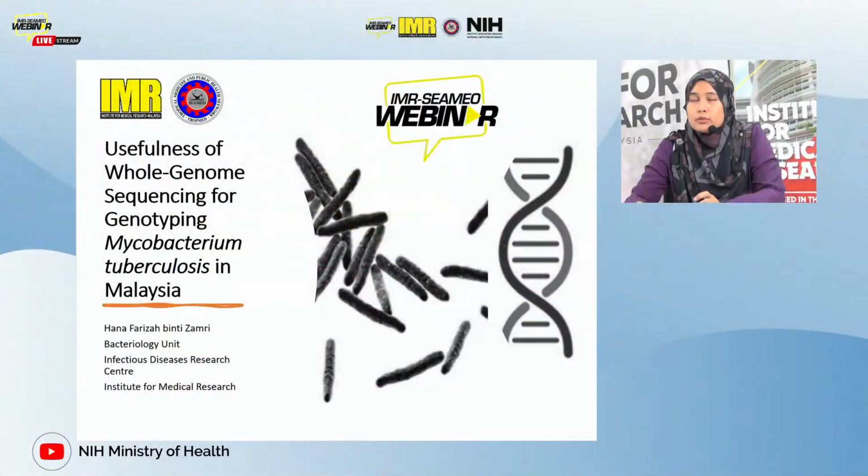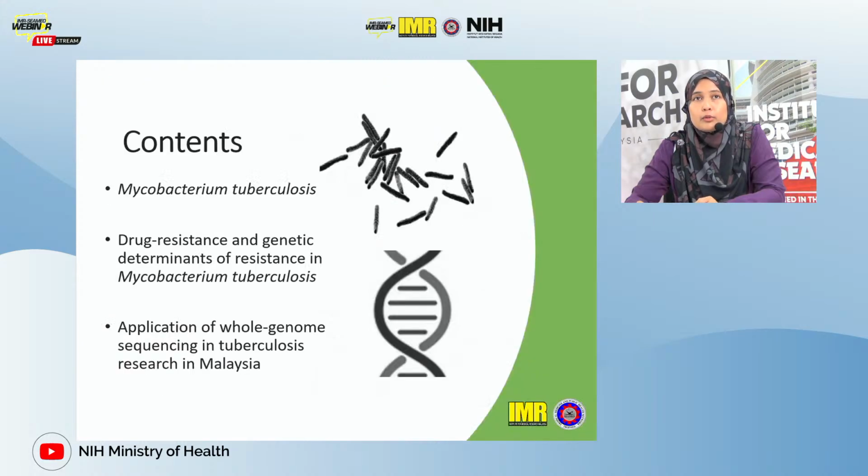For my presentation today, entitled Usefulness of Whole Genome Sequencing for Genotyping Mycobacterium Tuberculosis in Malaysia, I'll be talking a little about Mycobacterium tuberculosis, drug resistance and genetic determinants of resistance in Mycobacterium tuberculosis, and finally the application of whole genome sequencing in tuberculosis research in Malaysia.